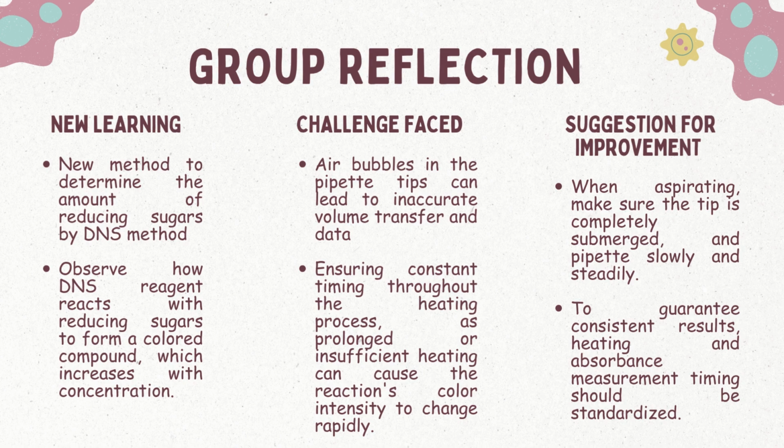So for the suggestions for improvement, for the pipette problem just now, when aspirating, make sure the tip is completely submerged and pipette slowly and steadily. For the timing problem, heating and absorbance measurement timing should be standardized to guarantee consistent results.